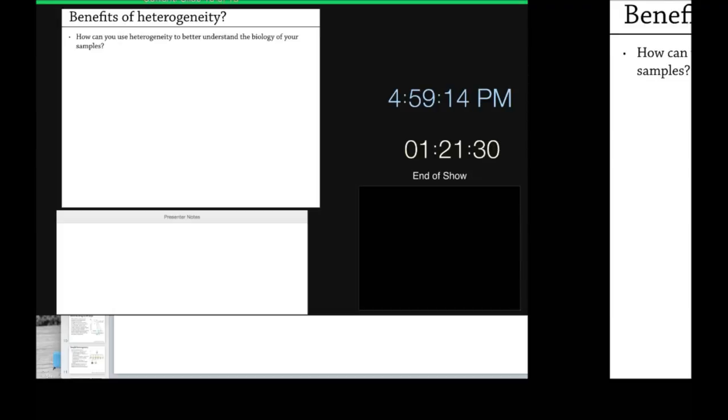The other issue is we're looking at things somewhere between 0 and liquid nitrogen temperature. We don't know the actual temperature of the specimen when it freezes. It's not 0, it's not liquid nitrogen temperature, it's somewhere along that trajectory. And as you said, ice thickness. The thicker the ice, the cooling rate is going to be different at different layers. In the very center, it's going to be frozen differently than at the edge. If it's a very thin specimen, then it should freeze much more uniformly.